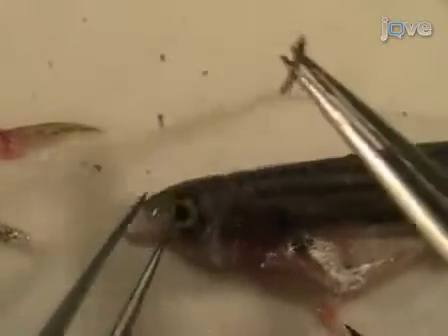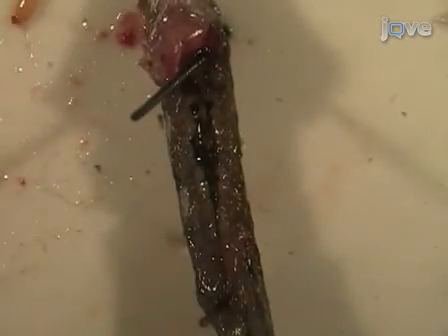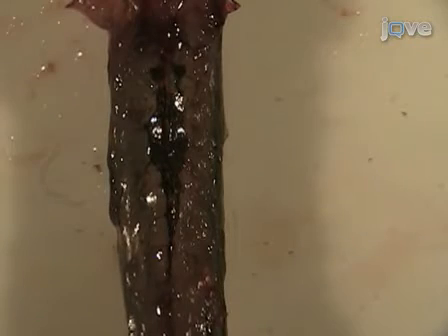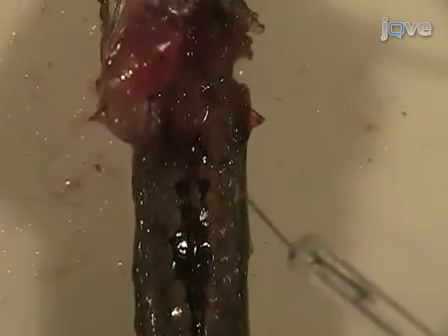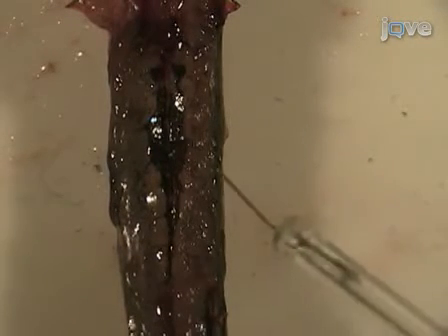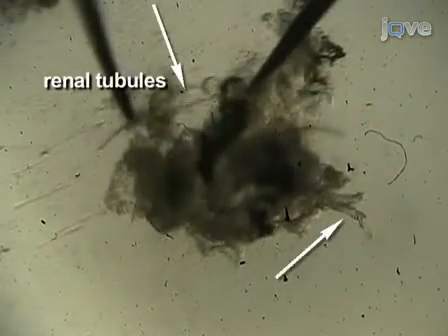Unpin the fish and re-pin it ventral side up to dissect the kidney. The kidney is a translucent pink structure located along the dorsal body wall and is associated with the dorsal aorta and pigmented cells. The kidney is divided into head, body, and tail regions. Dissect out a piece of the kidney and place it in PBS. Under the microscope, tease apart the kidney tissue with the needles to reveal the renal tubules.